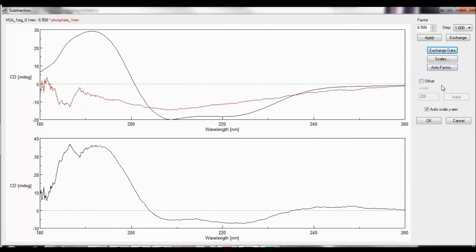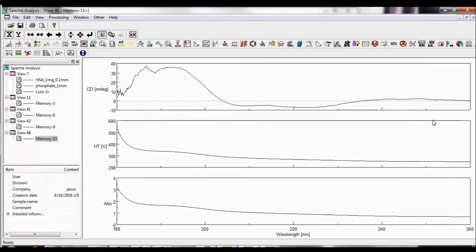The Offset option calculates the spectrum where the difference at a specified wavelength for two spectra is given as zero. To apply the subtraction parameters, click OK, and a new memory is created.